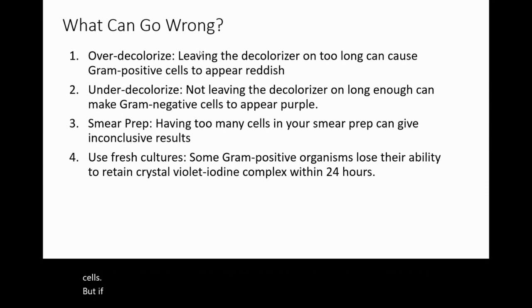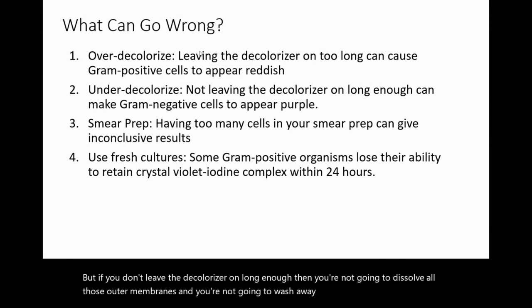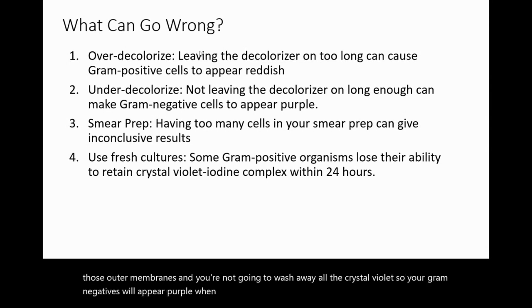But if you don't leave the decolorizer on long enough, then you're not going to dissolve all those outer membranes, and you're not going to wash away all the crystal violet. So your gram-negatives will appear purple when they shouldn't. Okay, so leaving that decolorizer on for the right amount of time is key.